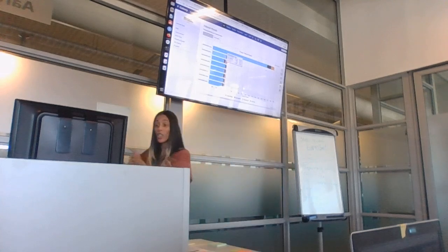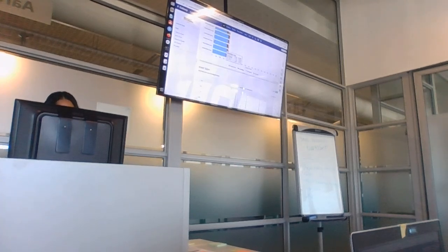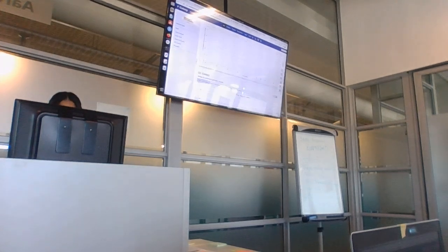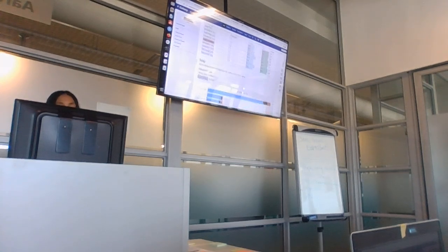This one was actually the original size. The others were reduced to 60% of the size. So that's why this one looks a bit different. But this one is actually a problem. If you have the original data set, this one is actually a problem, even though it has more in it. If you had 100 samples, you may not look at this block, because it would be the same as scrolling through each one of them and trying to find a problem.